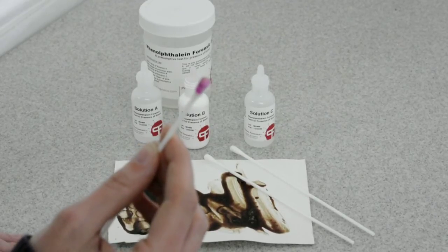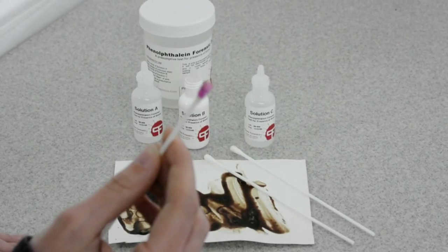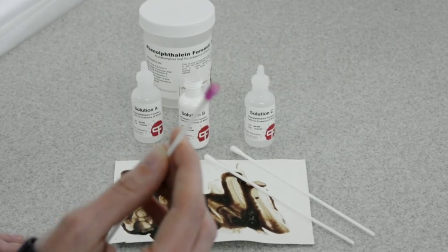And that concludes the simple, fast, and effective phenolphthalein presumptive blood kit.